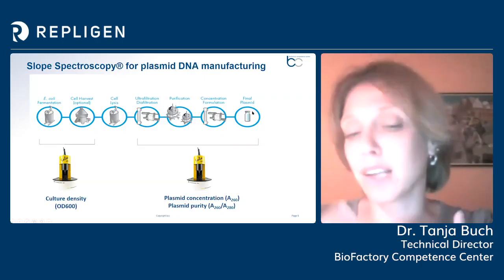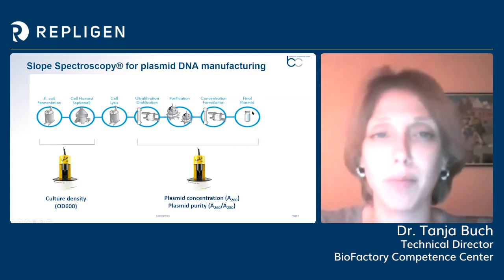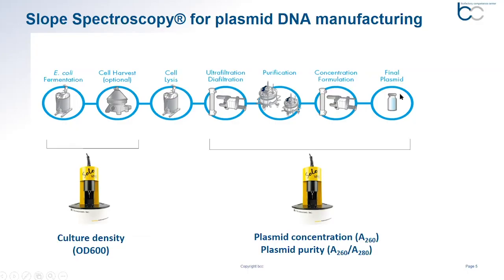You may think now, what does microbial fermentation have to do with gene therapy and viral vector production? But as you know, you always require a certain amount of plasmids in order to deliver the transgene or also the plasmids that encode for our viral particles into our mammalian cells or insect cells for the viral vector manufacturing process. And these plasmids are actually produced with a microbial process, in most of the cases with an E. coli fermentation. And since the demand and the interest in viral vector therapies has increased extremely over the last years, there's also a really high need for large-scale production of plasmids.